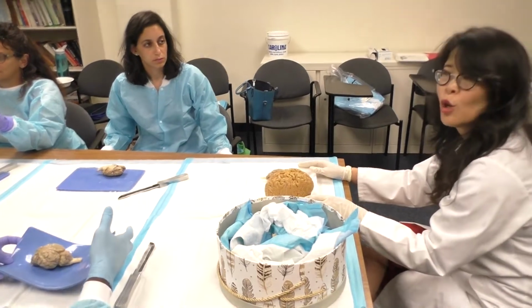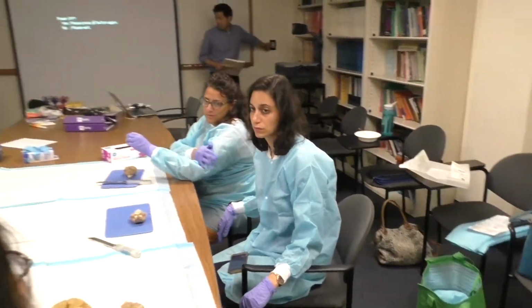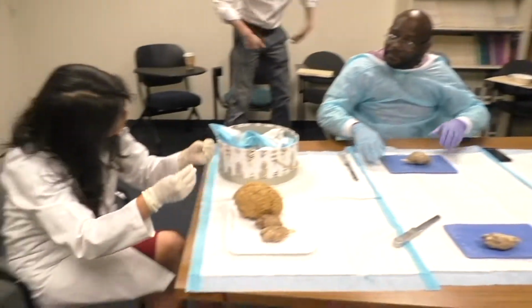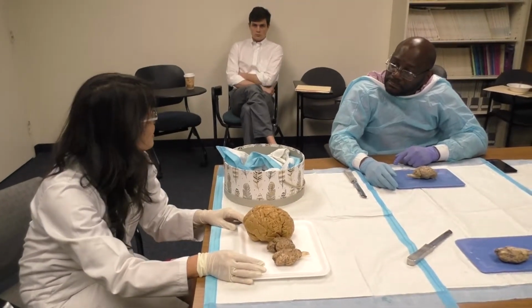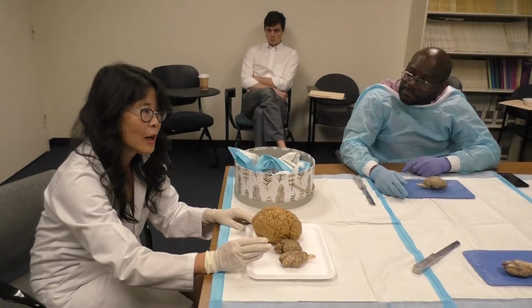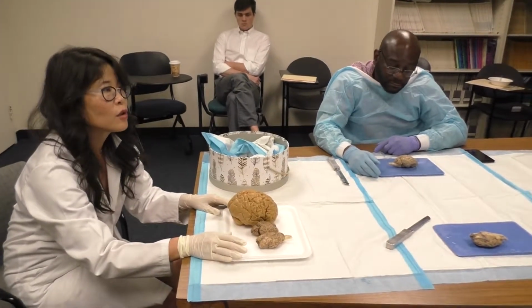What does the frontal lobe do generally? That's the cognitive. Can you control. Motor commands. Motor commands are a little bit farther back. Personality. If you damage the prefrontal, the lobotomy that they did in the 1940s, basically cutting the connections between the frontal lobe and the rest of the brain, it changes your personality.